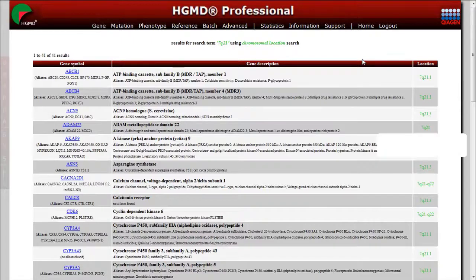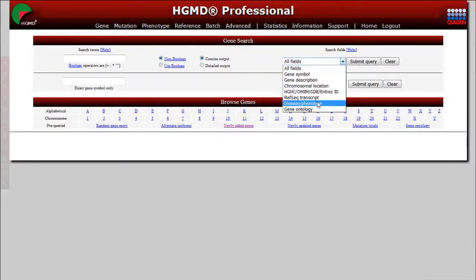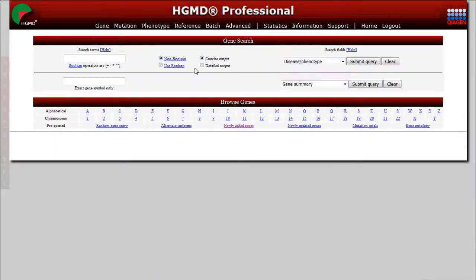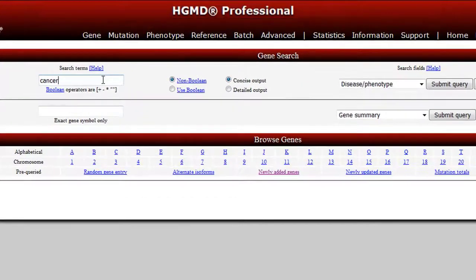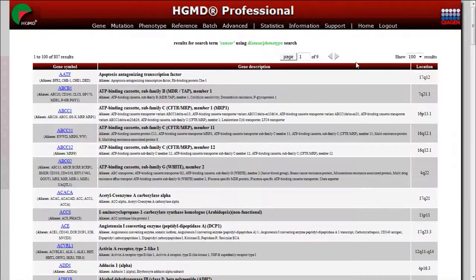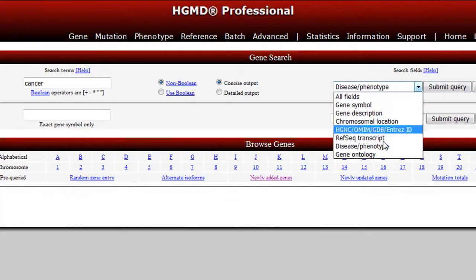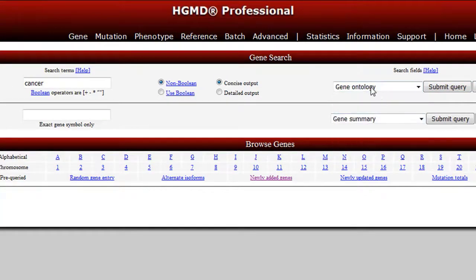Alternatively, search for genes by their associated disease phenotype, for example cancer, or by their associated gene ontology terms, for example segregation.